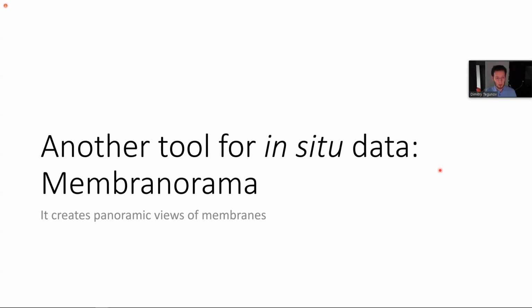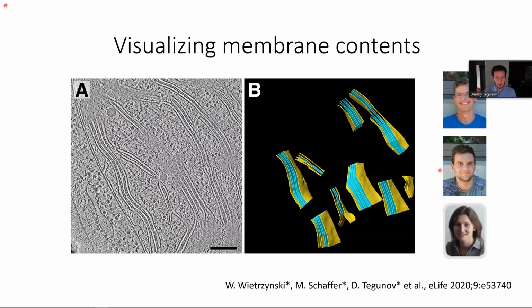That is, those membranes are not perfectly flat. So you cannot really find an angle inside this volume where you can just put a 2D plane through the volume and look exactly at the membrane as it lies flat in the image plane.